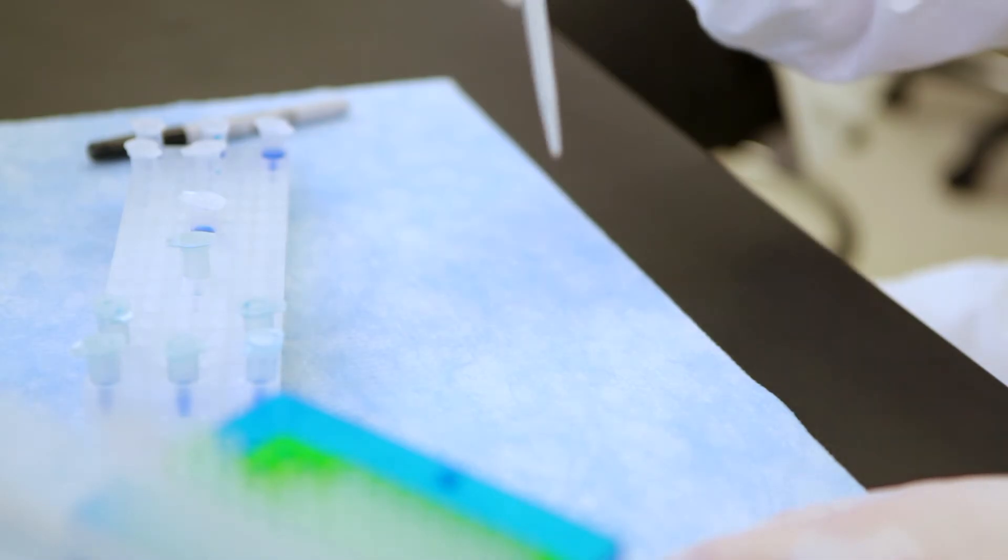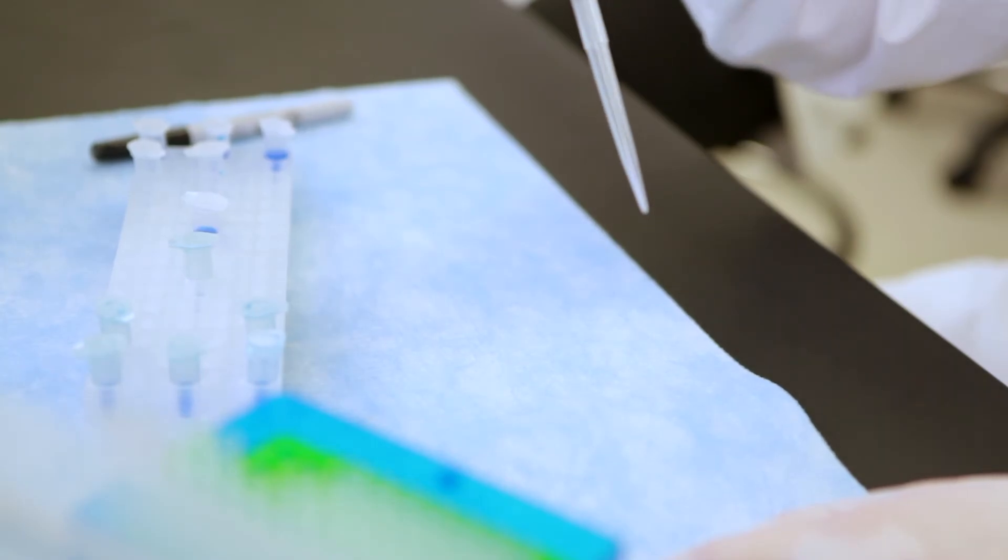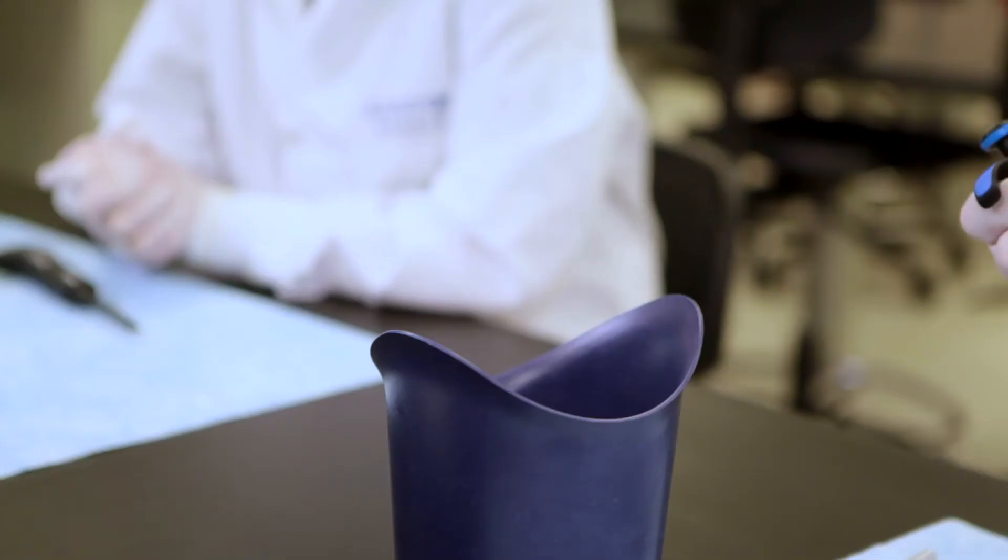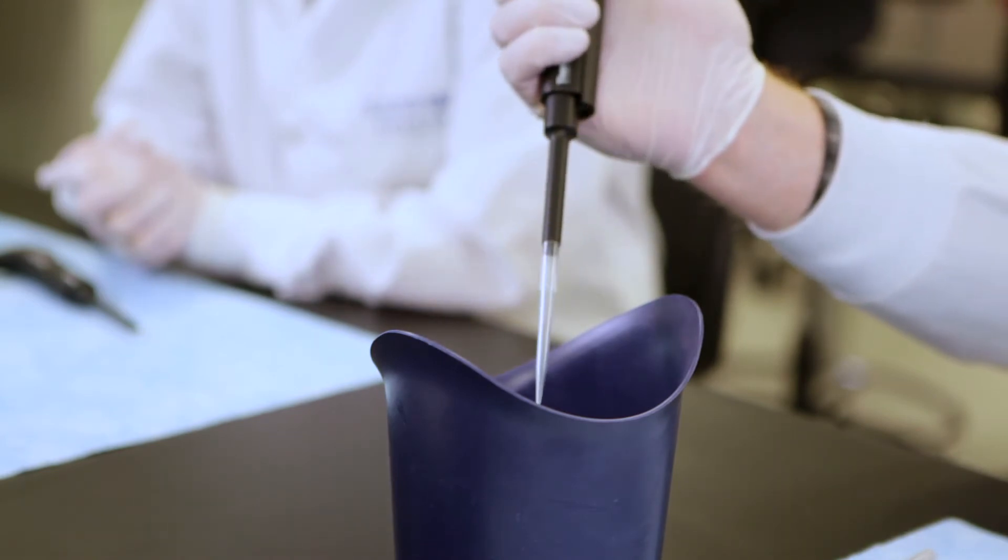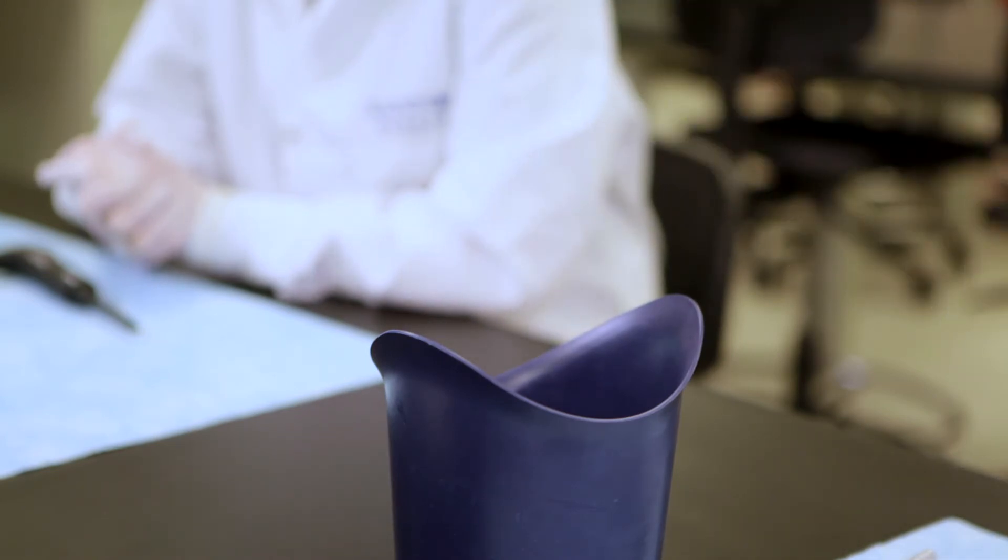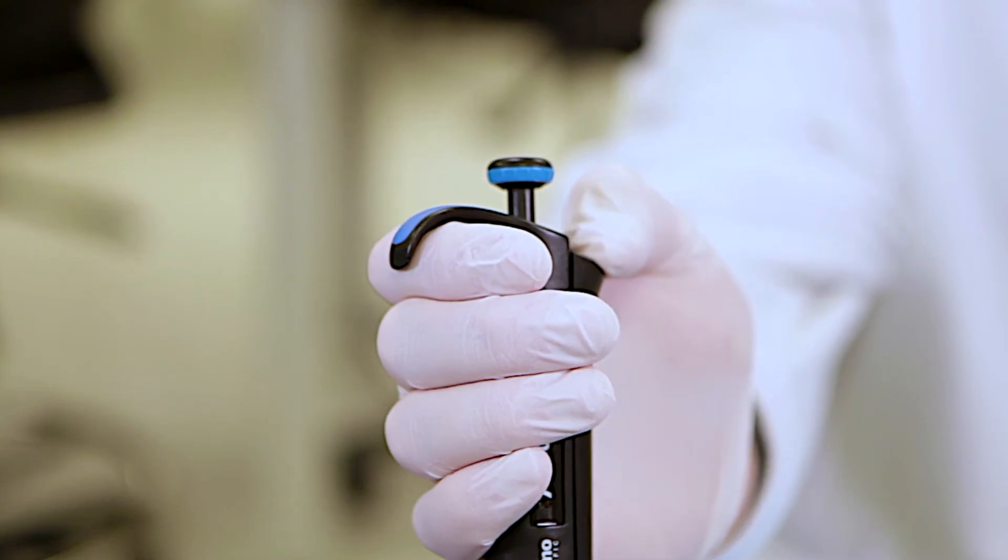Use a new pipette tip with each new liquid. If the tip touches any surface or any liquid other than the one you are pipetting, discard it and get a new one. Once you are finished pipetting, dispose of your tip by aiming the base of the pipette over the waste container and depressing the eject button. This should eject the tip from the pipette into the container.